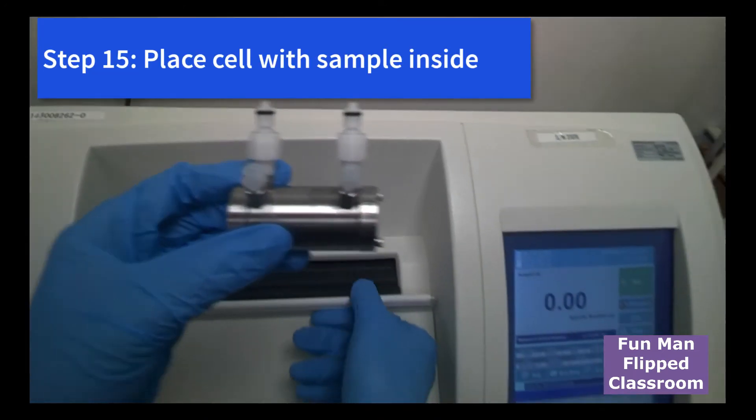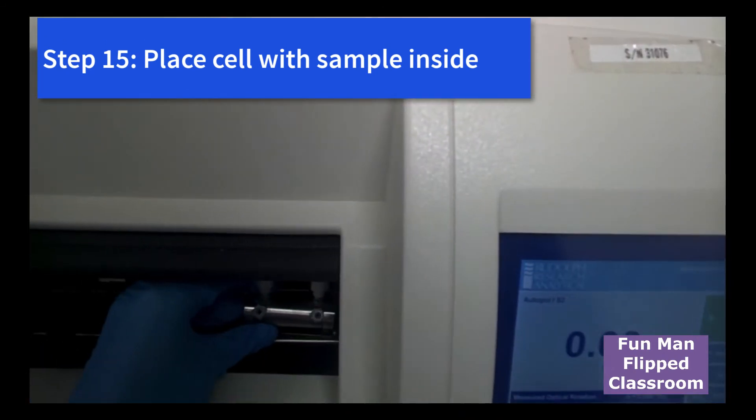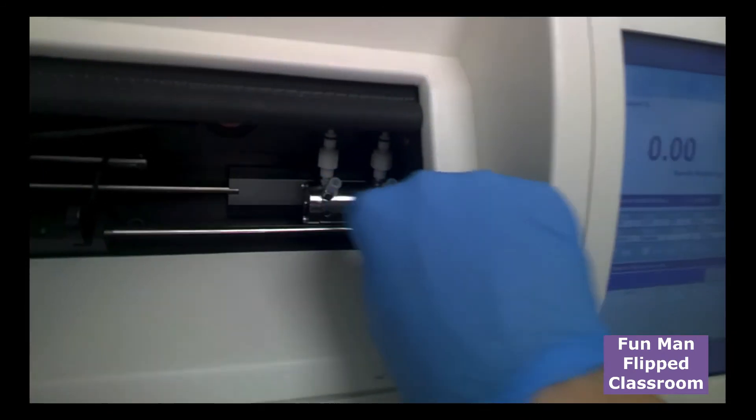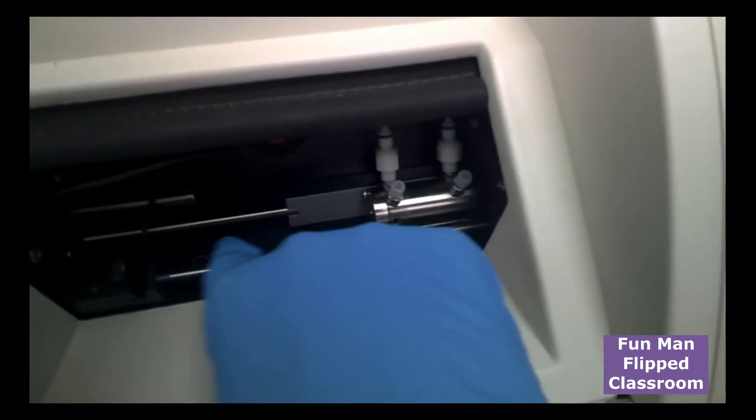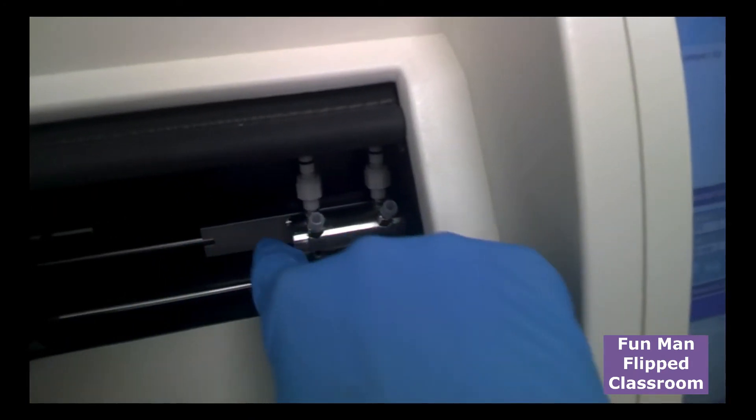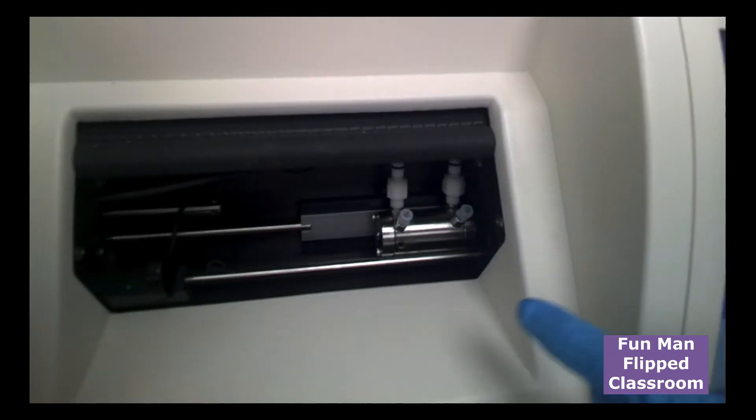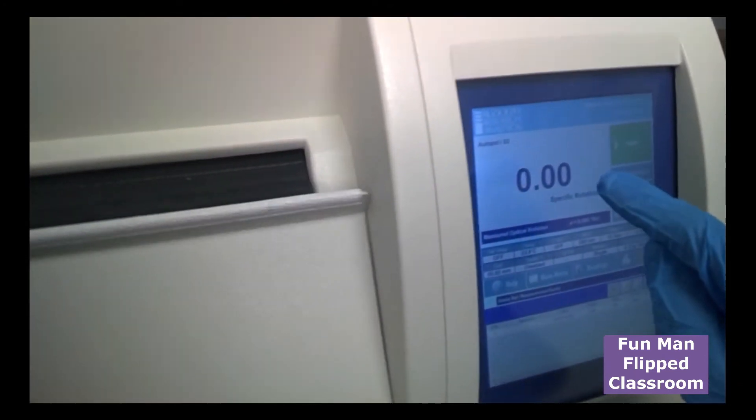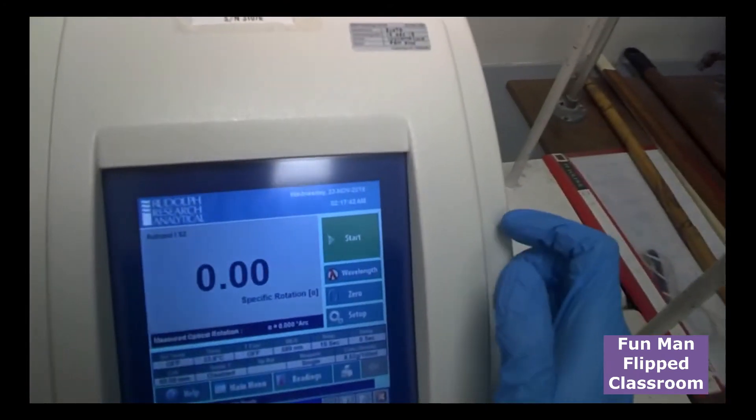So, I'll place the cell inside there. Push it to the right. Make sure it sits there. The ray should go through the path. If it doesn't sit properly, the ray might be blocked and you do not have a good measurement. Close the door tightly. And now, we press start.